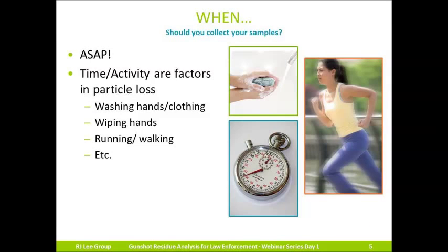Now I'm going to go over the when. So when do you want the sampling to occur? We frequently get asked on the stand when you should collect samples for gunshot residue analysis. The simplest answer to this question is to collect them as soon as possible after the incident.